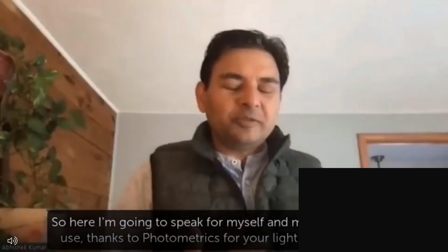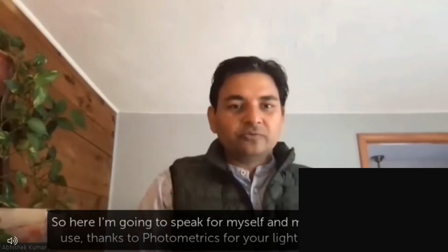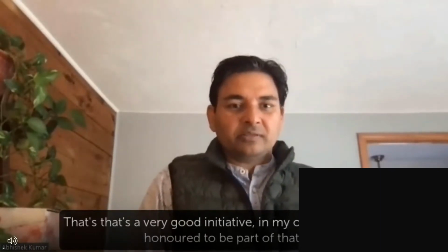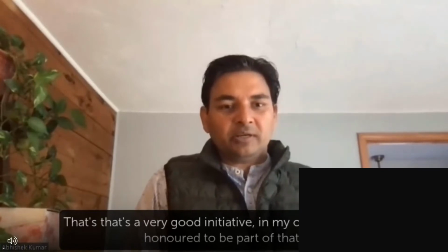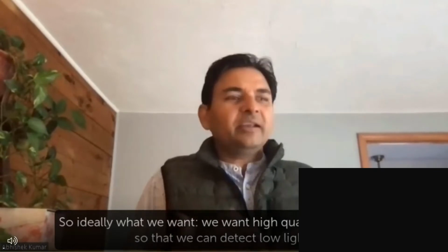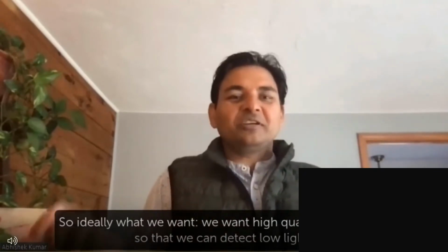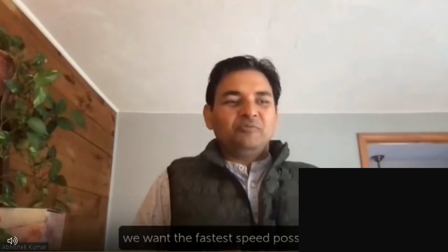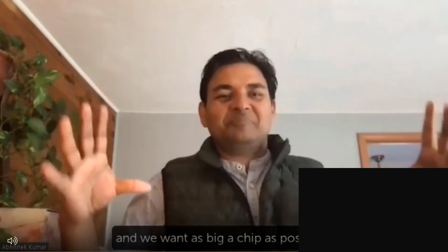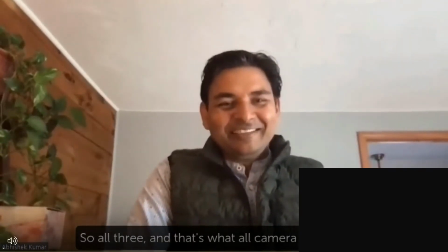Here I'm going to speak for myself and my lab. Thanks to Photometrics for your light sheet initiative. That's a very good initiative in my opinion, and I'm honored to be part of that. So ideally what we want is high quantum efficiency so that we can detect low light. We want speed as fast as possible, and we want as big a chip as possible. So all three.